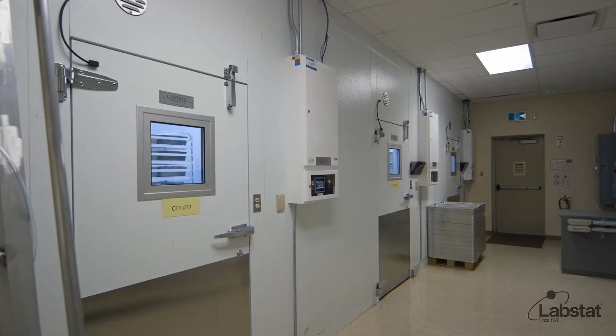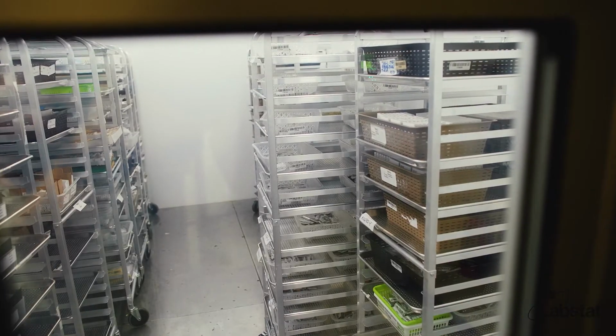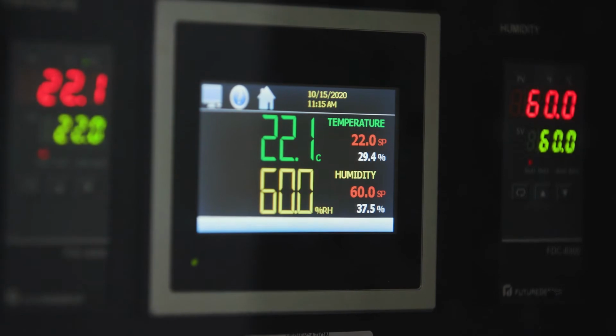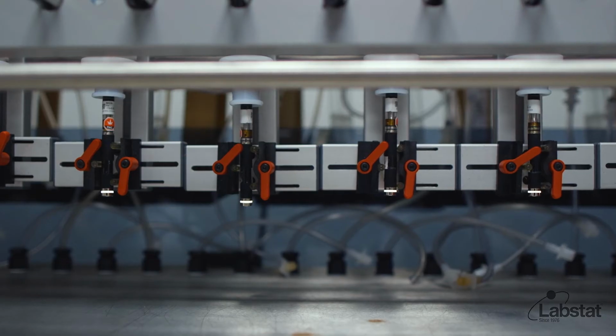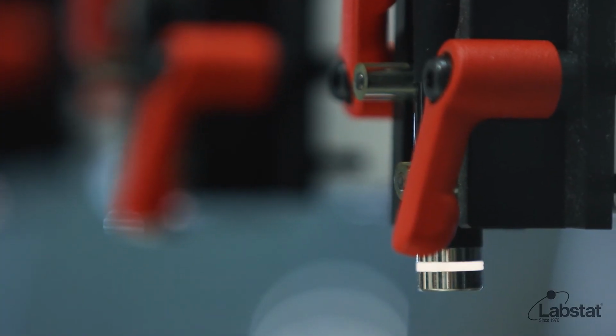During stability testing, samples are stored in highly secure stability chambers where we control the temperature and humidity levels over a desired period of time. The samples are then tested to study the potential changes in cannabinoid and terpene potency and the formation of potentially hazardous compounds.